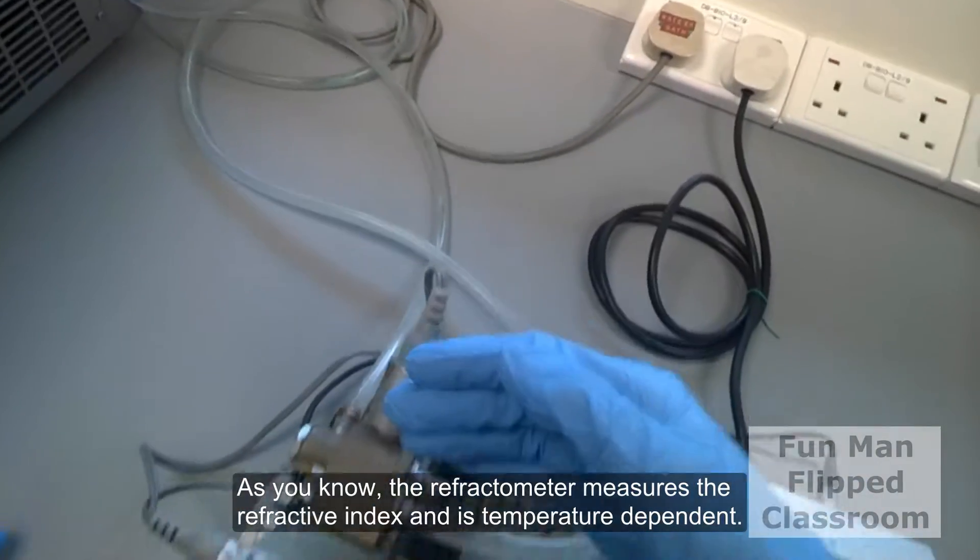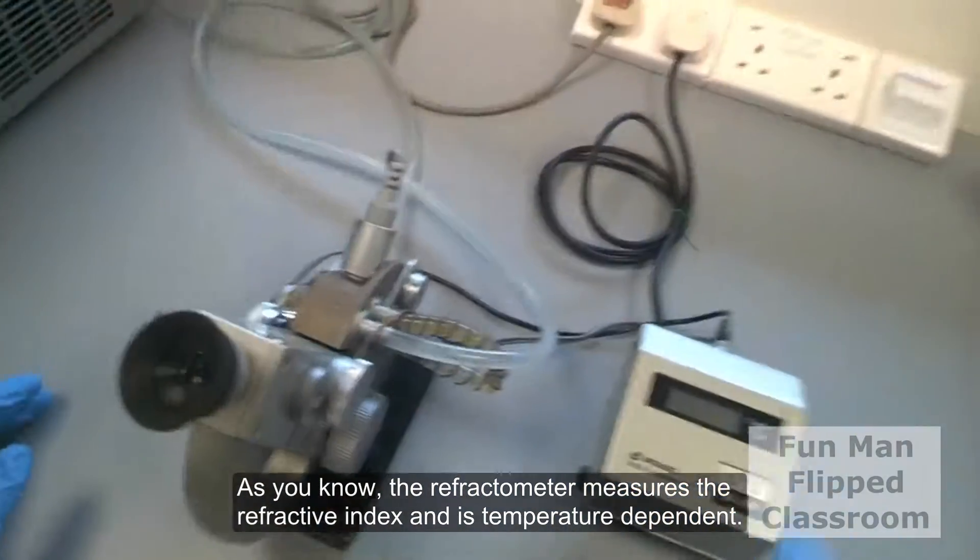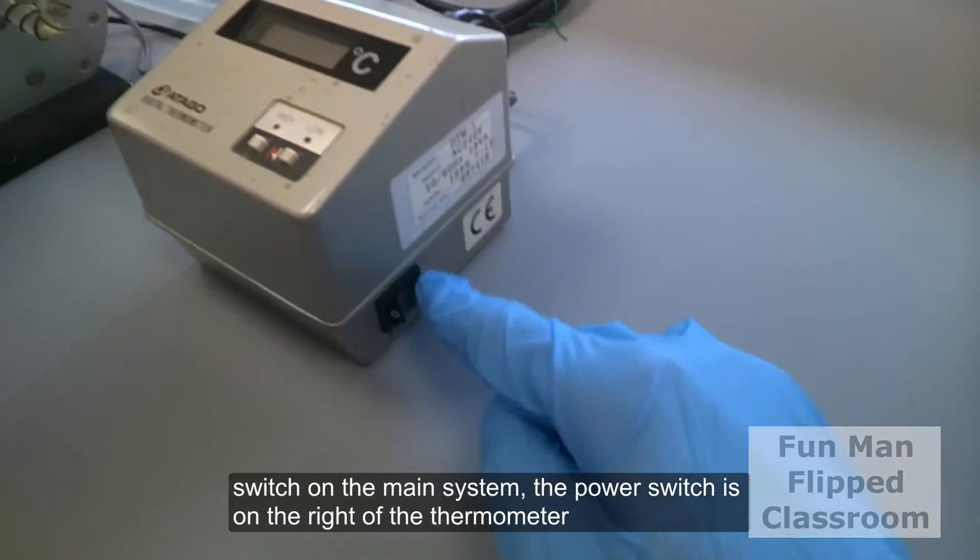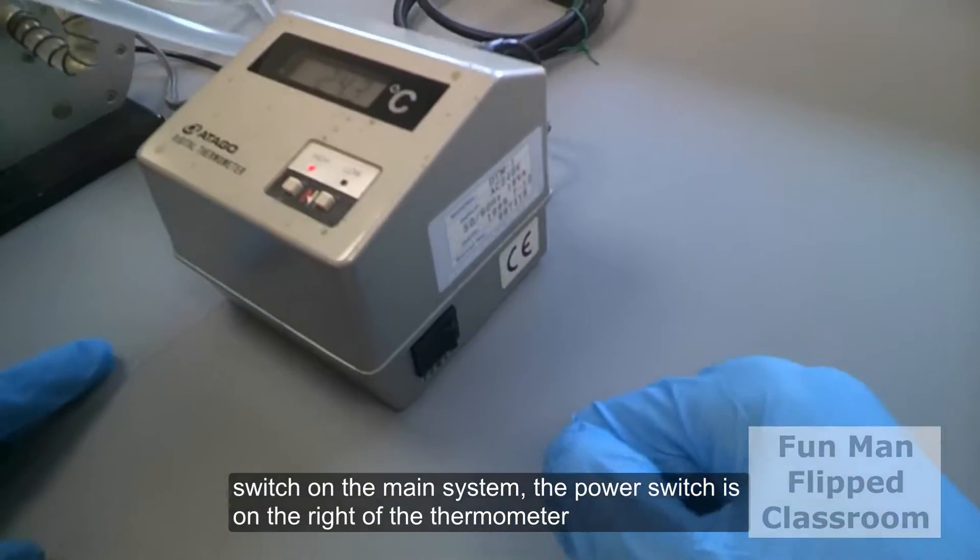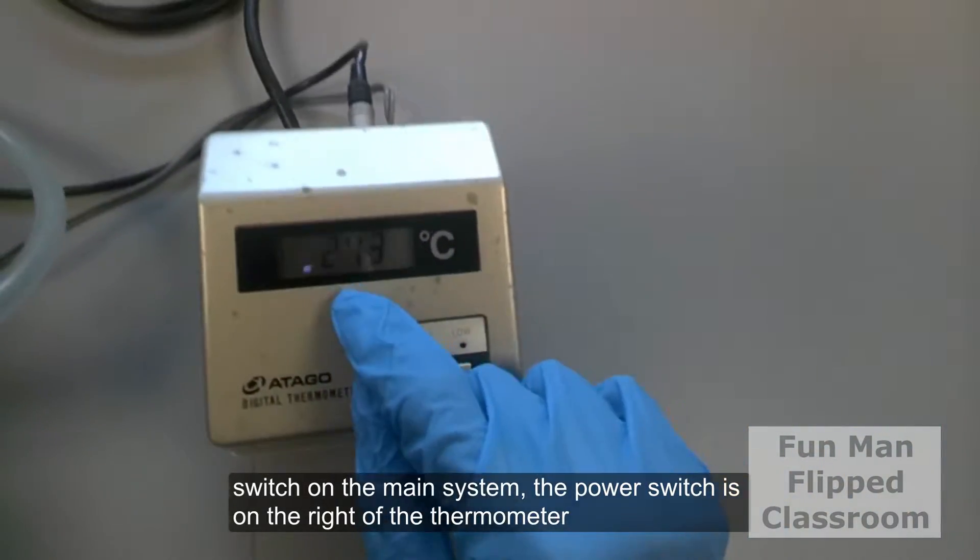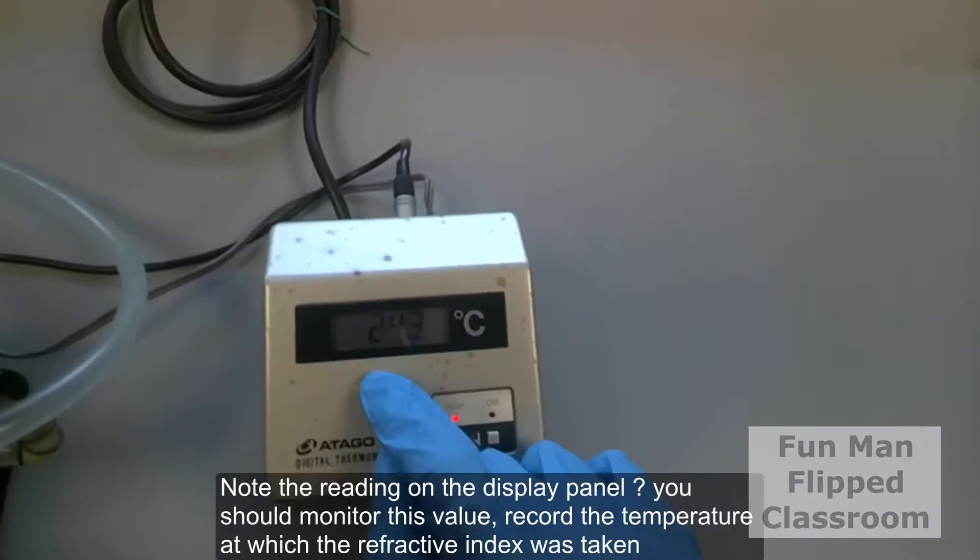As you know, the refractometer measures the refractive index and is therefore temperature dependent. Here, switch on the main system. The power switch is on the right side of the thermometer. Note the reading on the display panel. You should monitor this value.